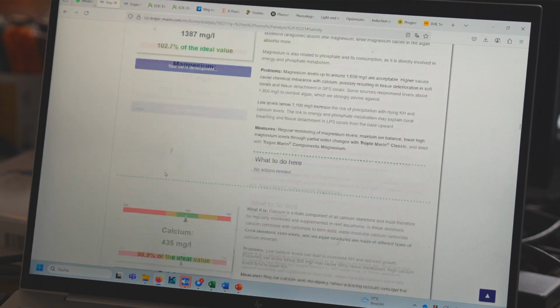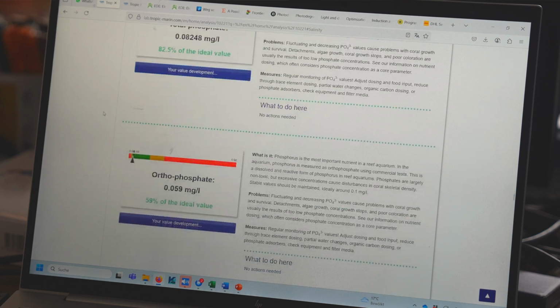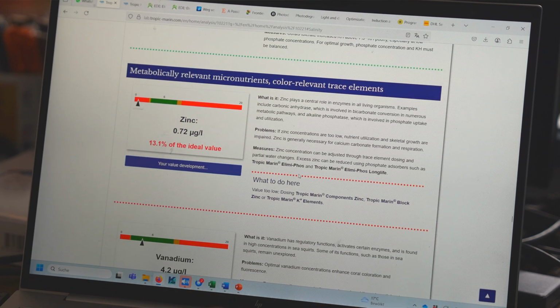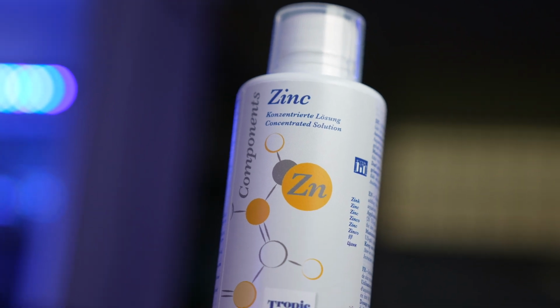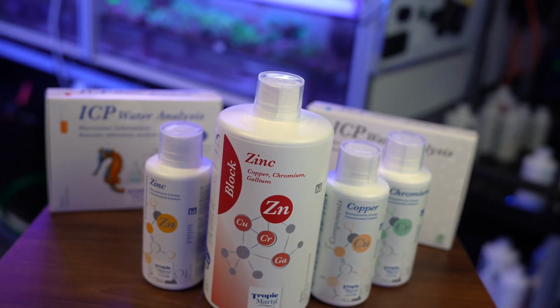Okay, that's all good. Then we go down to the macronutrients. So nitrite, nitrate. We're at 1 milligram, it's good, phosphorus, and now we enter the zone of the trace metals. Just as an example, we have our zinc value, it's fairly low, and the recommendation would be to add the right amount of zinc to come back into the right concentration range. This can be done either with a single element solution or with a block system. There will be a concrete recommendation of what you could add with regards to your tank.